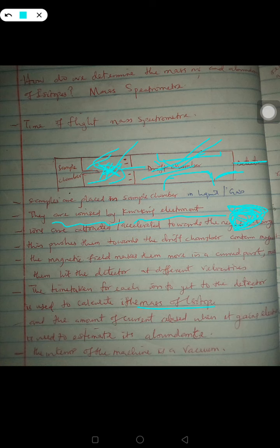And when you're mentioning the mass spectrometer, you must mention that the interior of the machine is a vacuum. It's very important. Why do they say it's a vacuum? A vacuum is technically a region that contains no air, that contains no medium. There is no air there, there is no water. It's just an empty space. That's a vacuum.